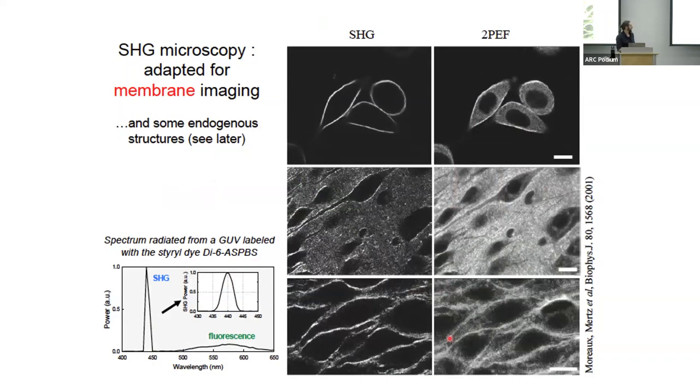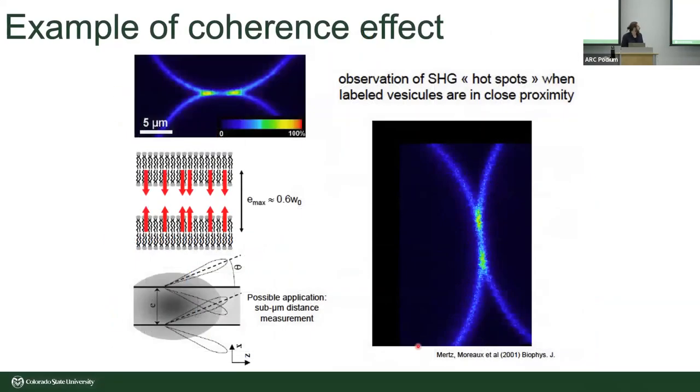So more exciting is just to look at images and see what happens when you're looking at second harmonic generation and two photon together. Often they're complementary, they show you different regions of the tissue. You can learn a lot about polarization states. Usually these are not co-localized, so you get some sort of other information about morphology of your sample. There's also the potential to do some interesting things based on the structure that's required.